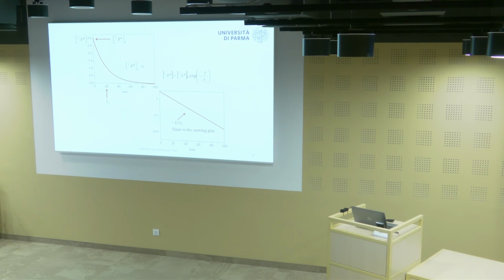However, with a modern computer, there is no real need to do this. But if you want to make sure that the system is mono-exponential, plot it like this, because it will immediately look like a straight line. If it's not, it requires that you get into that in more detail.